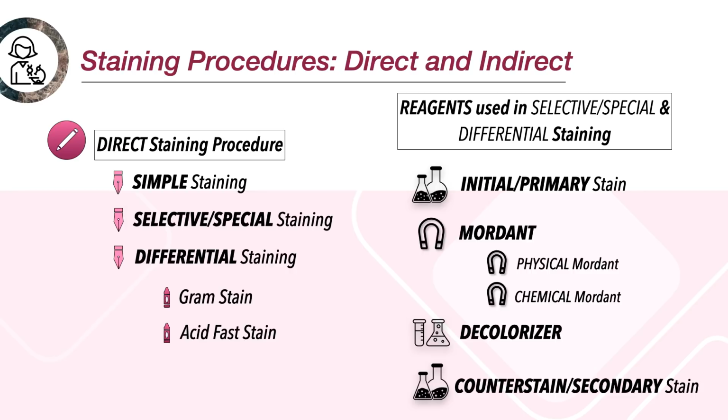Okay, ma'am, paano yung ma'am? Masasapawan? No, hindi necessary. Okay? Hindi masasapawan necessarily yung mga hindi na decolorize kanina. Okay? Again, this is just to further differentiate the bacteria present in your smear amongst each other. You will know more about this later, alright?